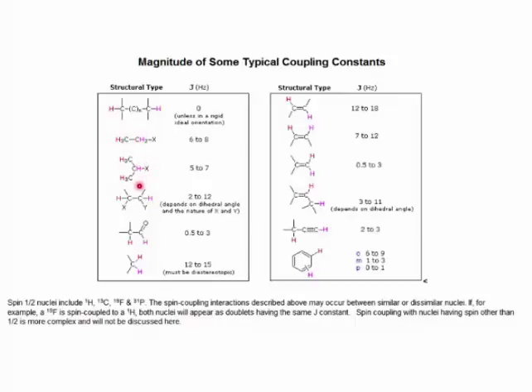Now let's look at these two entries. The hydrogens that are colored, respectively, red and purple, are true neighboring protons. There's going to be splitting between them, causing multiplets in an NMR spectrum. We have the situation here that we'd have actually seen before, where we have hydrogens bonded to adjacent carbons. The magnitude of the splitting that we normally see is, for this situation, 6 to 8 hertz, and for this, 5 to 7 hertz.